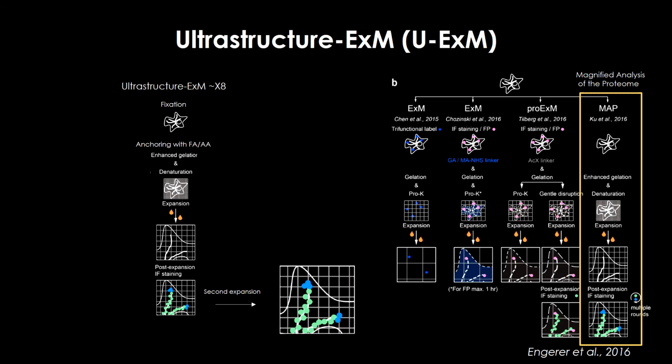So for this technique, it is advised to use antibodies that would probably work for Western blot, because in Western blot we also denature the proteins beforehand.